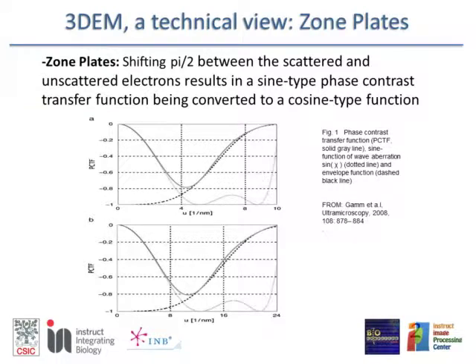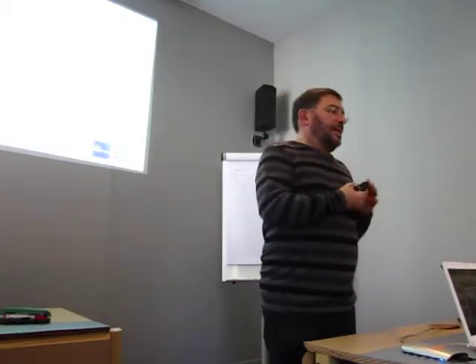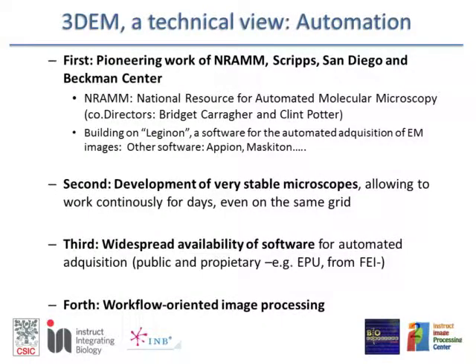I didn't go in, you don't have information with what I've said to go into this slide, okay? Because I tried to be very simple, and I leave that for Javi, that anyways is the next session. But this point spread function, in electron microscopy, we normally work in Fourier space, and we call it contrast transfer function. I'm not going to get into that. It's what is called zone plate, but it's actually something that is happening now, genomics, proteomics, things like that, as high throughput technologies. And how was this possible?